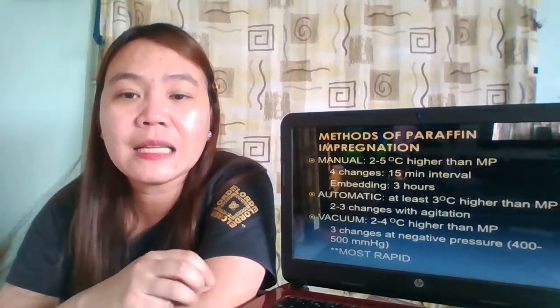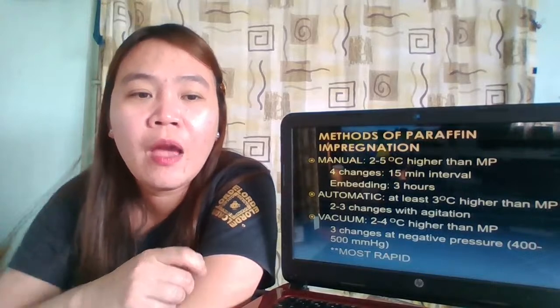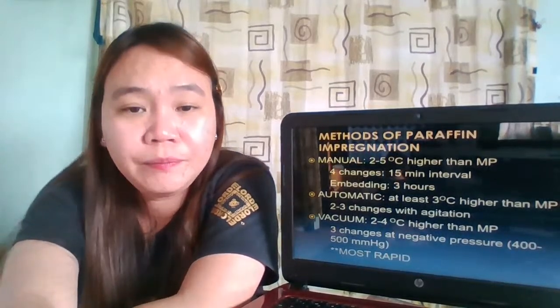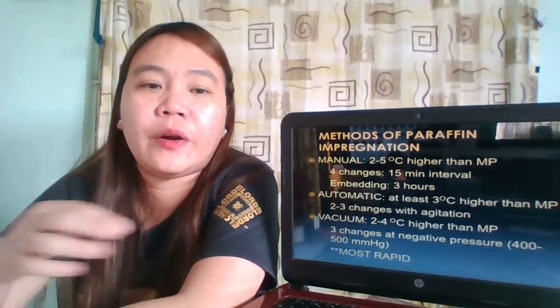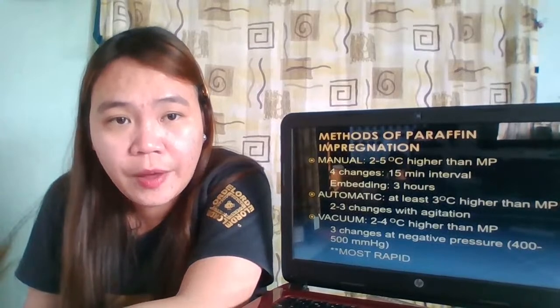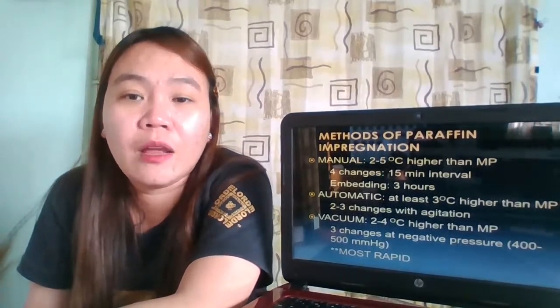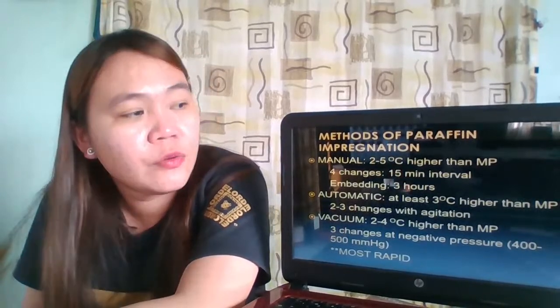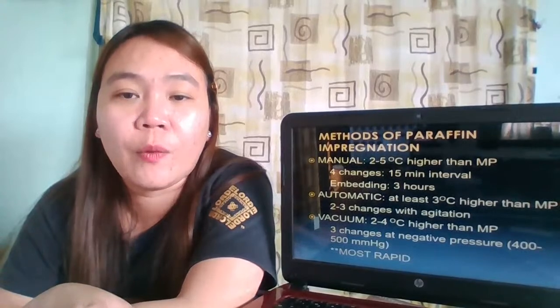And then lastly, we have the vacuum method. For the vacuum method, the required temperature is 2 to 4 degrees Celsius higher than the melting point of the wax.